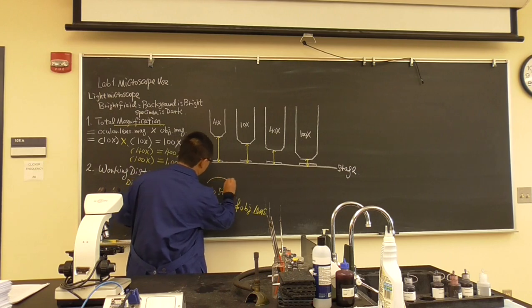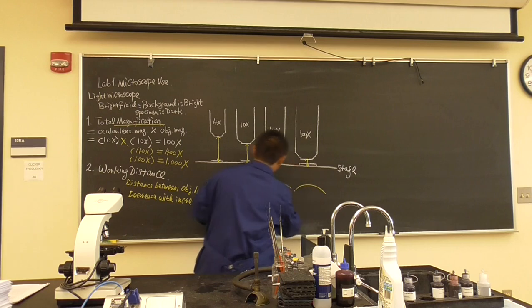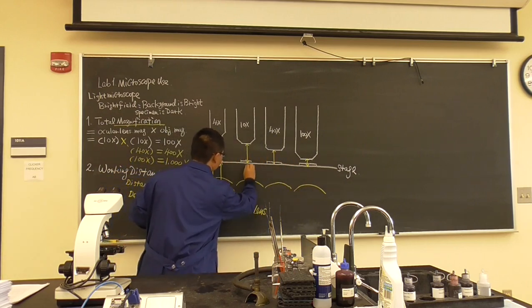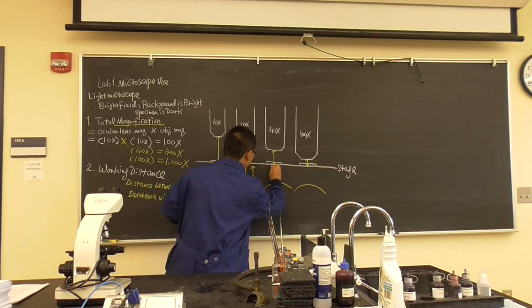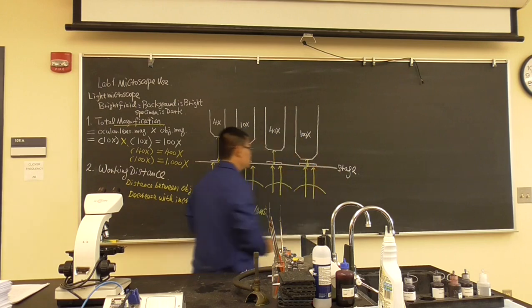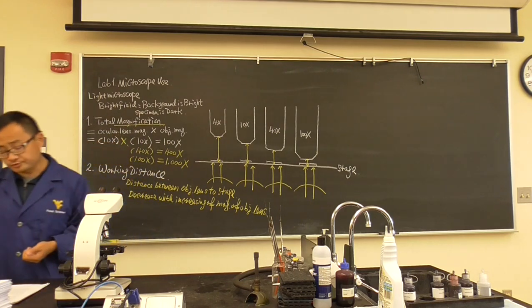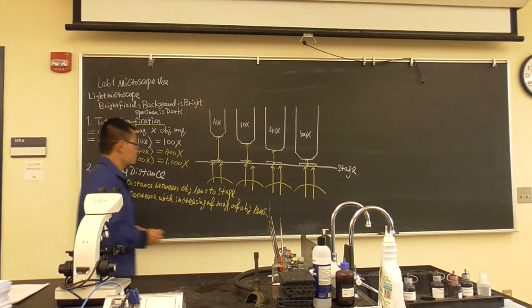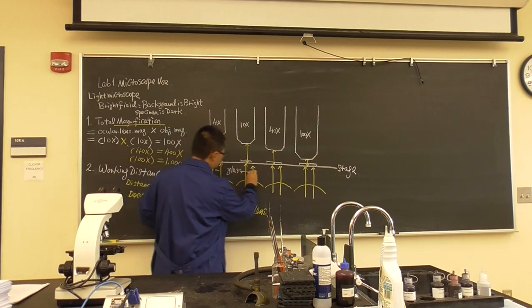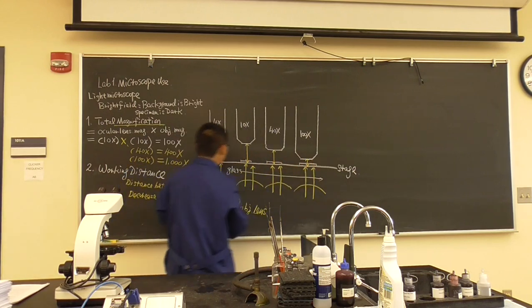So let's say there's light right here, right here, right here. They go up. That's not a problem. From the bottom, they go through the condenser and into the stage. Now they're causing a problem, because the light source and the condenser is glass. This whole section is glass. And here is air. Remember?